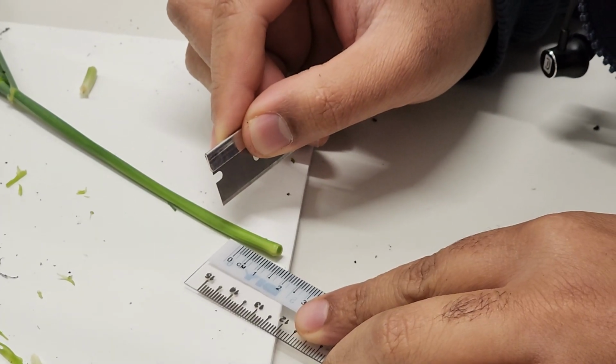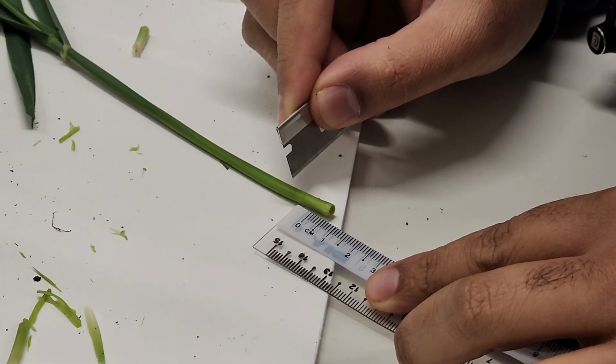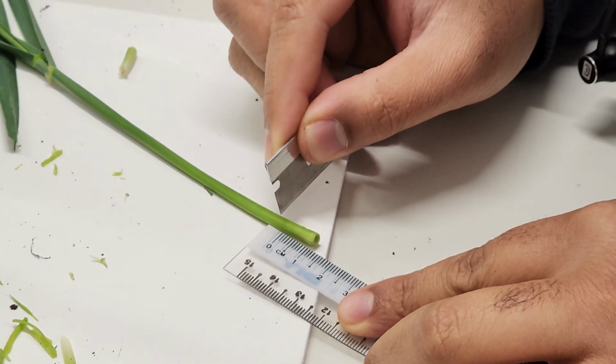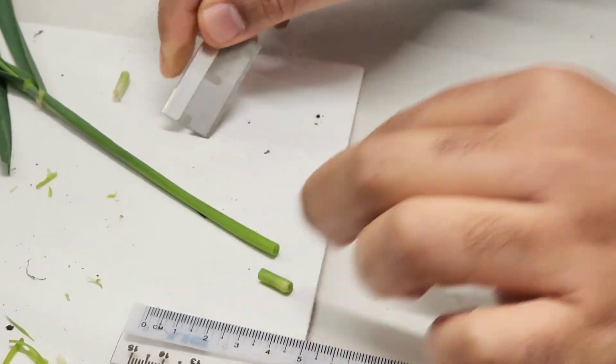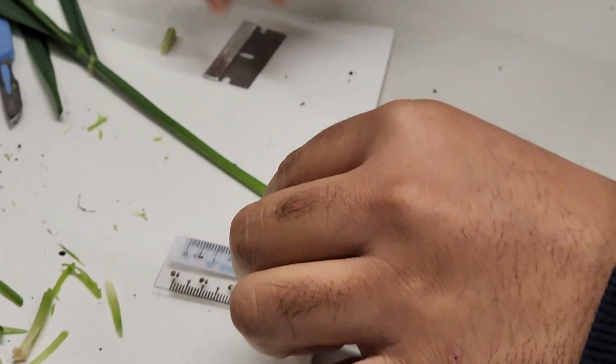This is the base. So I'll take about 1 centimeter of it because I suspect the meristem is in here. Yep, put it in there.